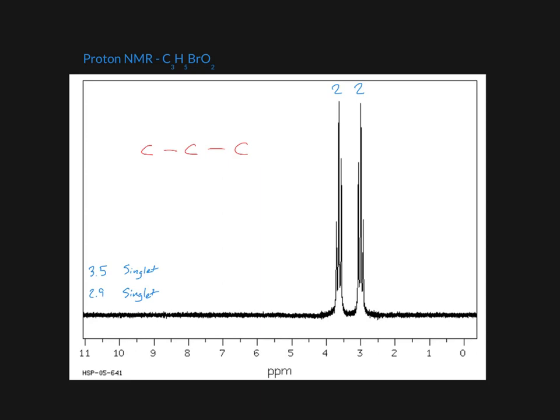Now we will also use our other findings from our previous graphs of infrared and mass spectrometry to decide what functional groups we will have. And if we remember, we did have carbon-to-carbon sp3 bonds, which we have in our molecule thus far. And we also had a carboxylic acid. It doesn't matter what end we would put our carboxylic acid, but we'll start over here on the left. So, carboxylic acid to an O to an H.